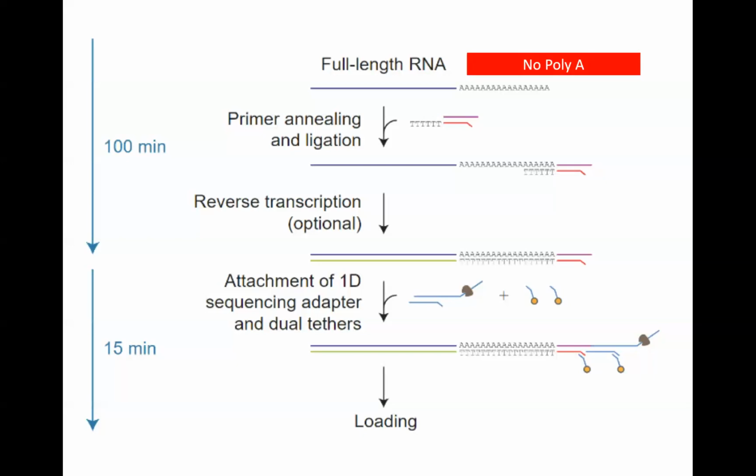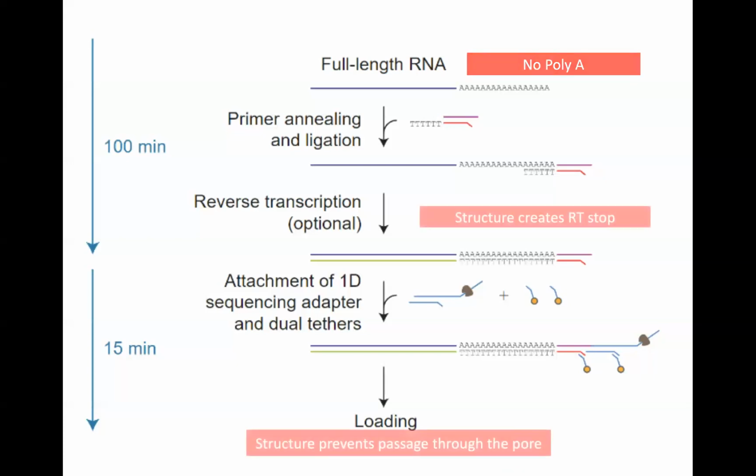And here we have a potential of the standard protocol generating some biases, because those tRNAs or those other short RNAs that people may be studying, and the modifications they will be able to study on them, may be connected with a specific biological context, like, for example, degradation of these RNAs. So the same tRNA that is not marked for degradation may have different modifications. And this information is getting lost with the standard protocol.